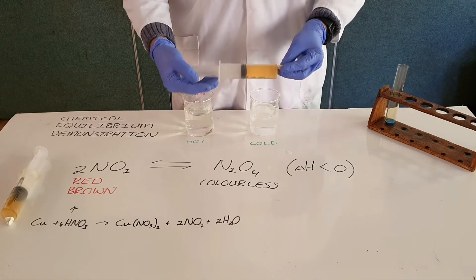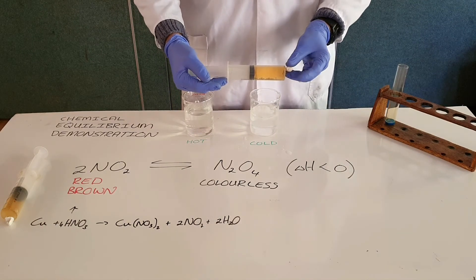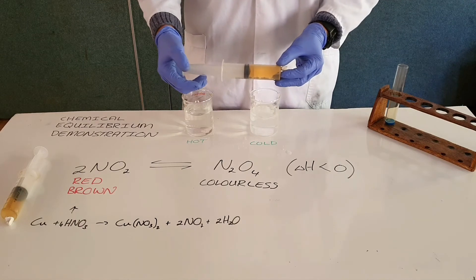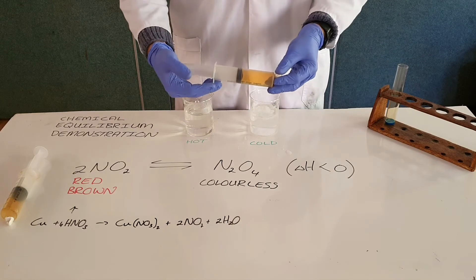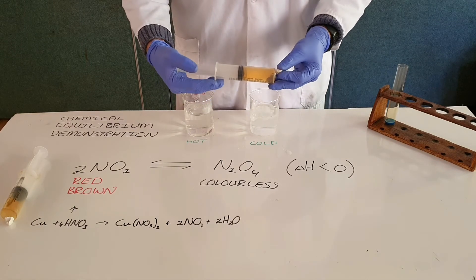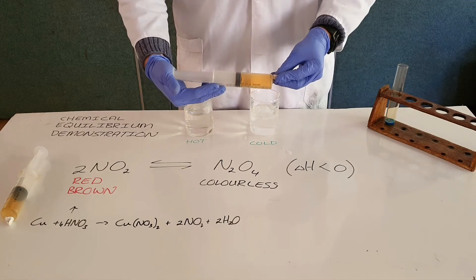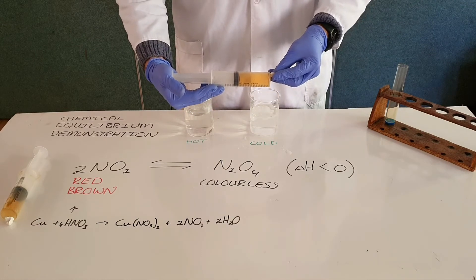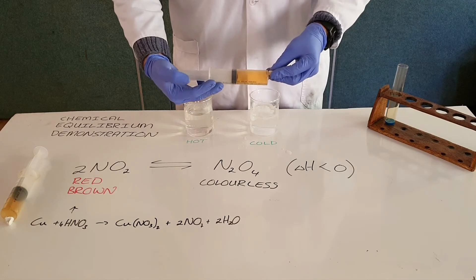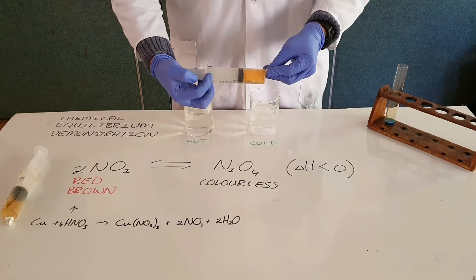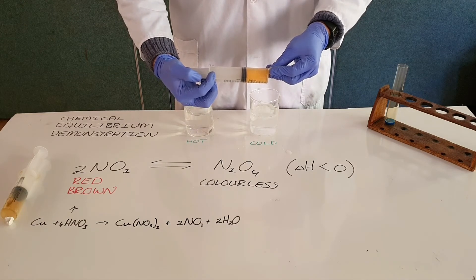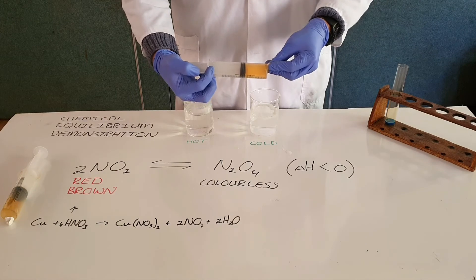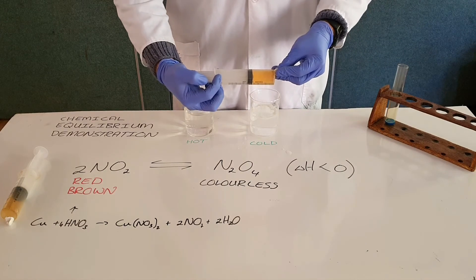Note that there are going to be two changes. The initial change is that the same number of molecules now occupy a smaller space, so the concentration increases and the gas becomes darker. Then, after that initial change, if you pay attention, you can see it becomes lighter or more colorless. Here we go — you can see the initial change shows a darker gas, and then after that it becomes lighter and clearer as the reaction favors the direction that produces fewer molecules.